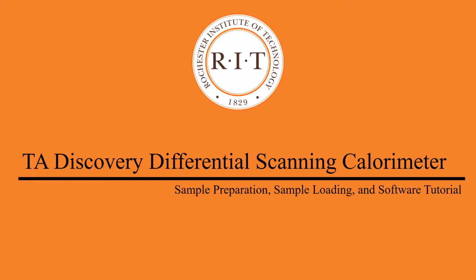Welcome back to the Rochester Institute of Technology, where today we will be going over sample preparation, sample loading, and a software tutorial for the TA Discovery Differential Scanning Calorimeter.